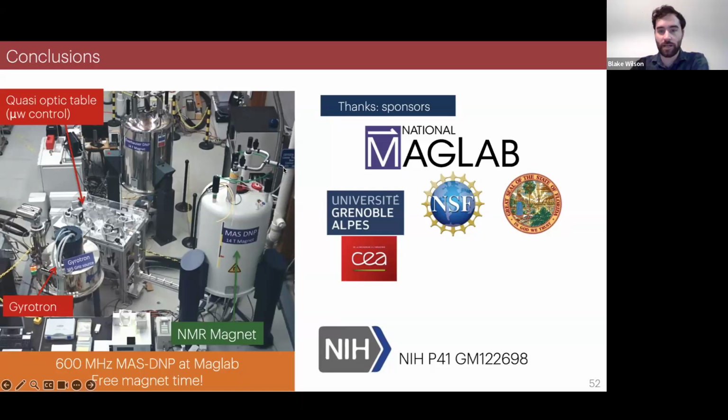Great, thank you. I have a question from Asif, following up on the protonation question. Does the fact that there are a lot more protons around lead to faster relaxation of the radicals, and do you have to worry about that in calculations?